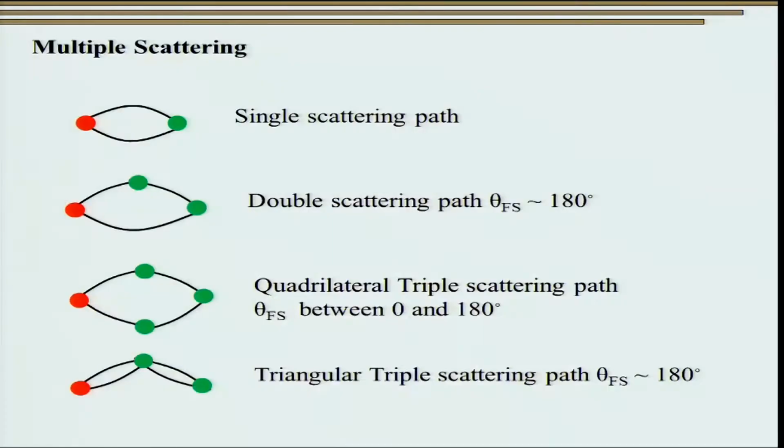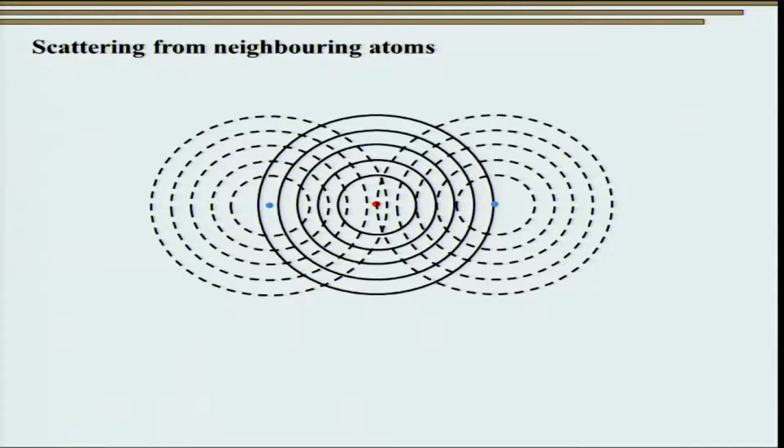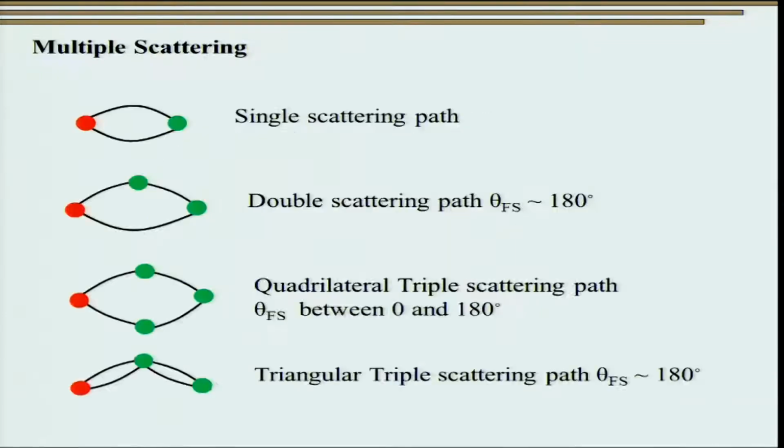So, what kind of interaction can take place? What I showed in the earlier figure is a very simplistic assumption, where each and every atom is just reflecting the waves in nice spherical form. However, this may not be true. There are various kinds of interaction that may occur. Here we have some possible scattering or multiple scattering events.